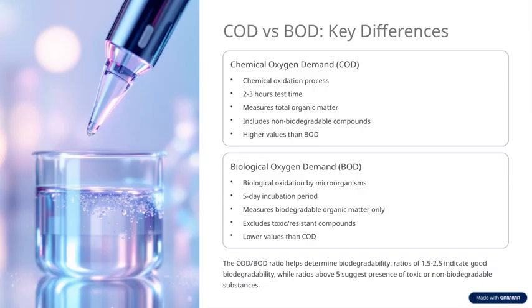Now, moving on to biological oxygen demand, or BOD. This test relies on biological oxidation by microorganisms and takes about 5 days to incubate. BOD specifically measures the biodegradable organic matter. That is, the stuff that microorganisms can actually break down. It does not account for toxic or resistant compounds that are not easily biodegradable, so its values tend to be lower than COD. An important concept here is the COD-BOD ratio.